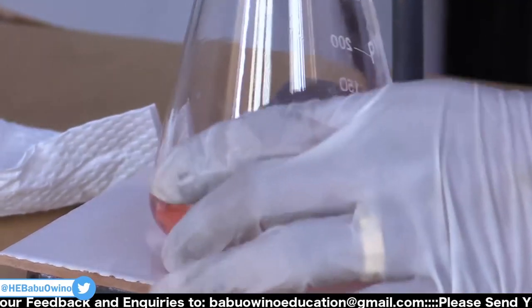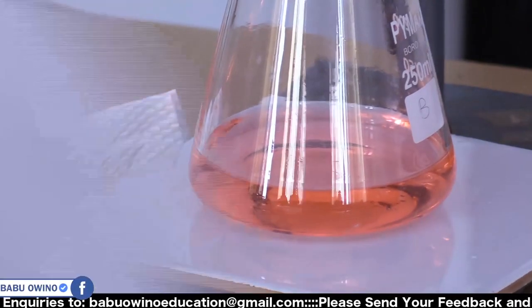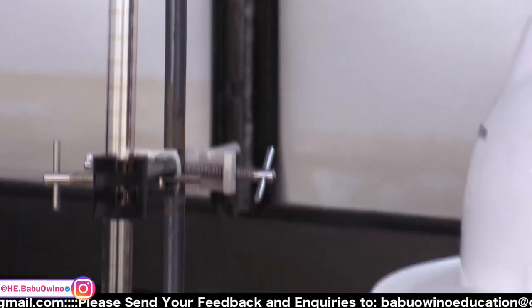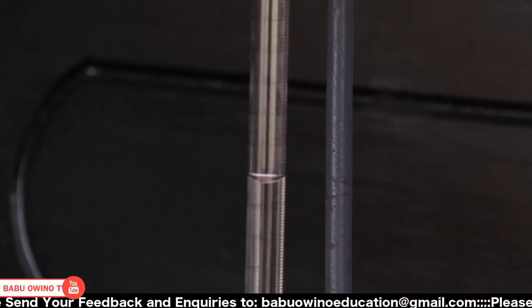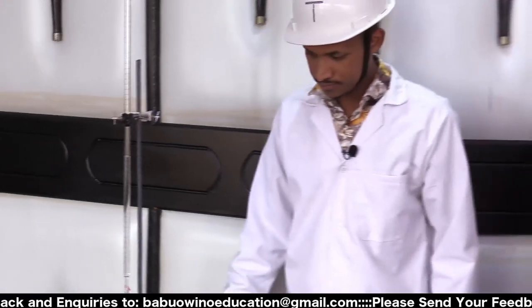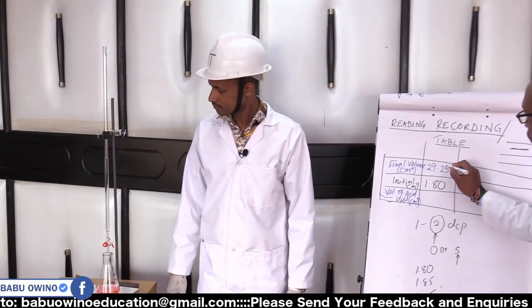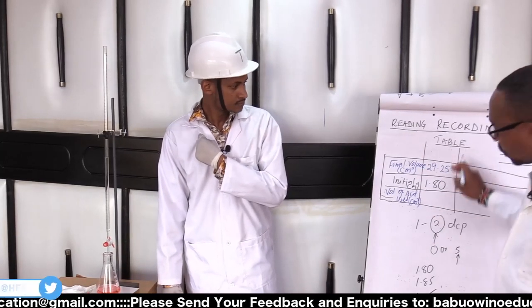So this is okay. Now you can see we have this. Let us make the readings. Our reading here is 29.2. Remember to be very careful. 29.2, and if you're in pairs, you confirm. So 29.25 according to me. So let us use mine.